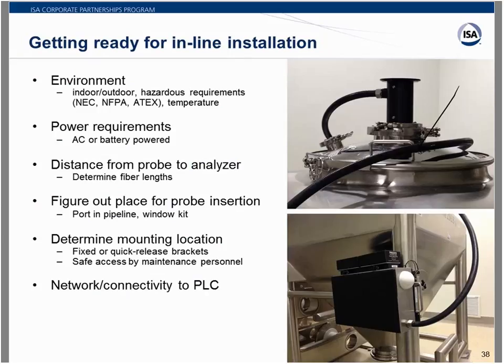The spectrometer can be customized based on the power requirements and the type of probe required for analysis. Sometimes it becomes mandatory to use an AC or DC powered spectrometer since industrial applications differ in various circumstances. Also, due to design constraints and challenges enforced by the industrial production unit, the spectrometer probe needs to be engineered based on the length, size, and the environmental conditions in order to fit the process line.